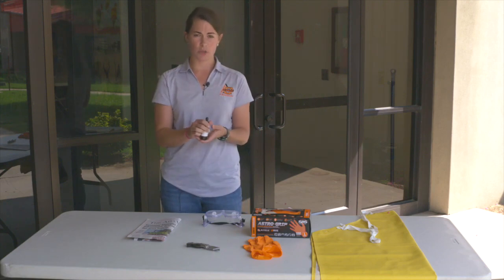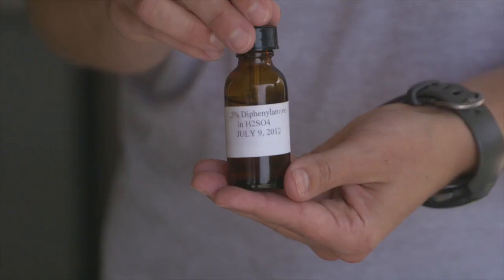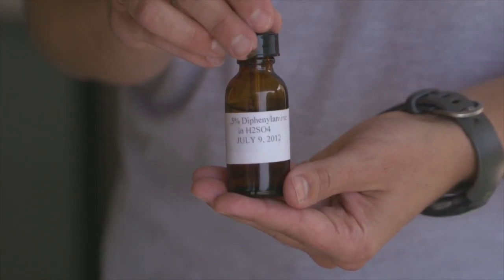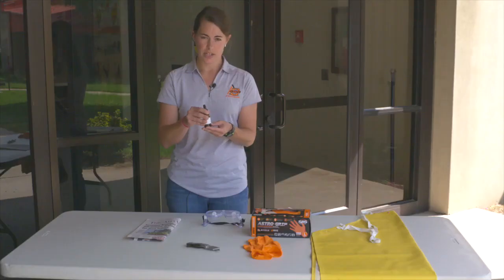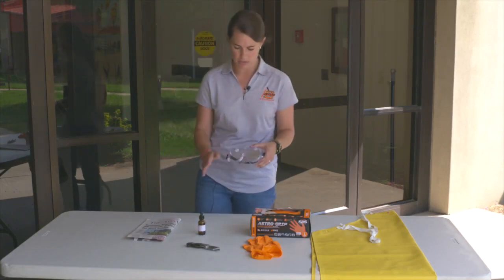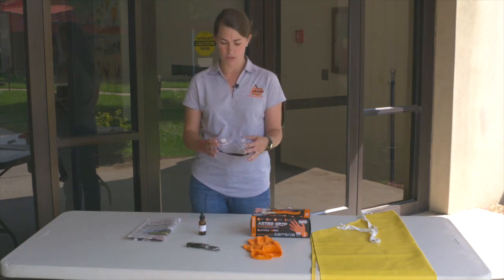Of course, the diphenylamine — a good bottle of diphenylamine that's been properly tested for accuracy so that we know it's properly indicating the nitrates. We also encourage the use of goggles, because as you know, this is acid and can damage a lot of things.